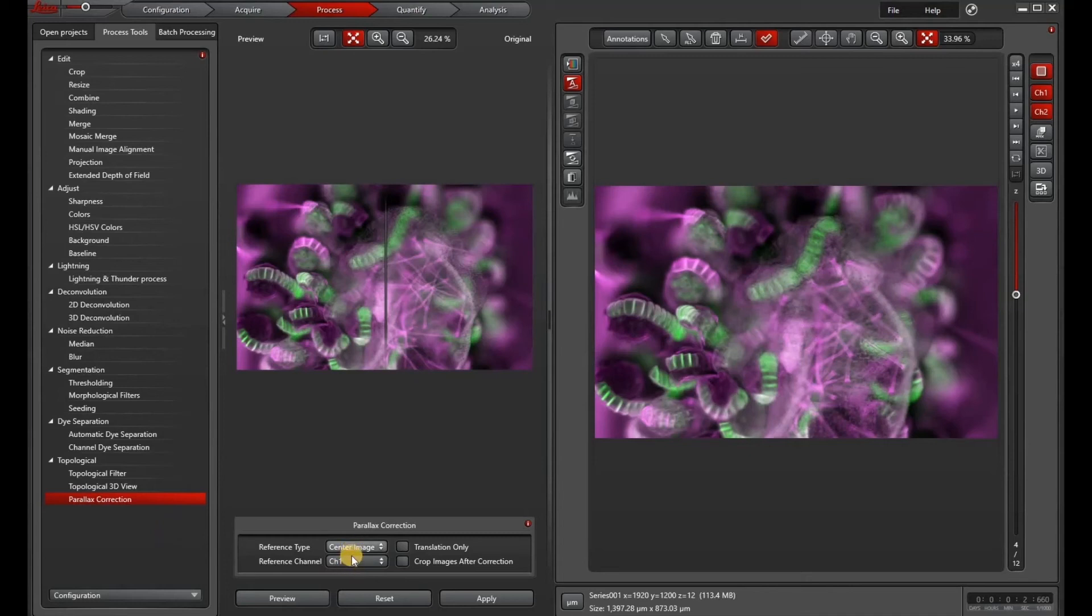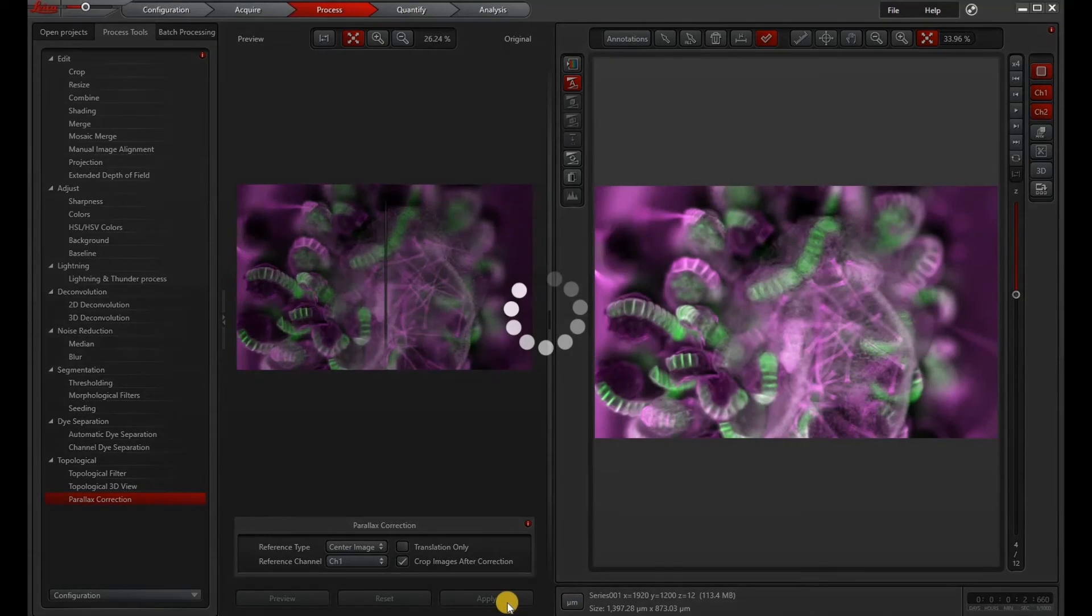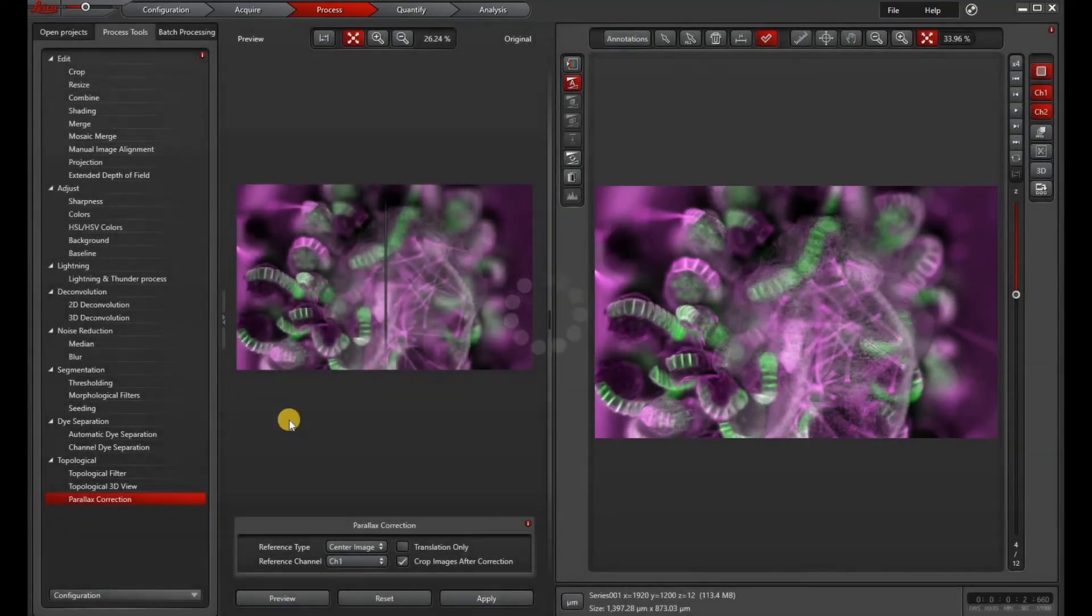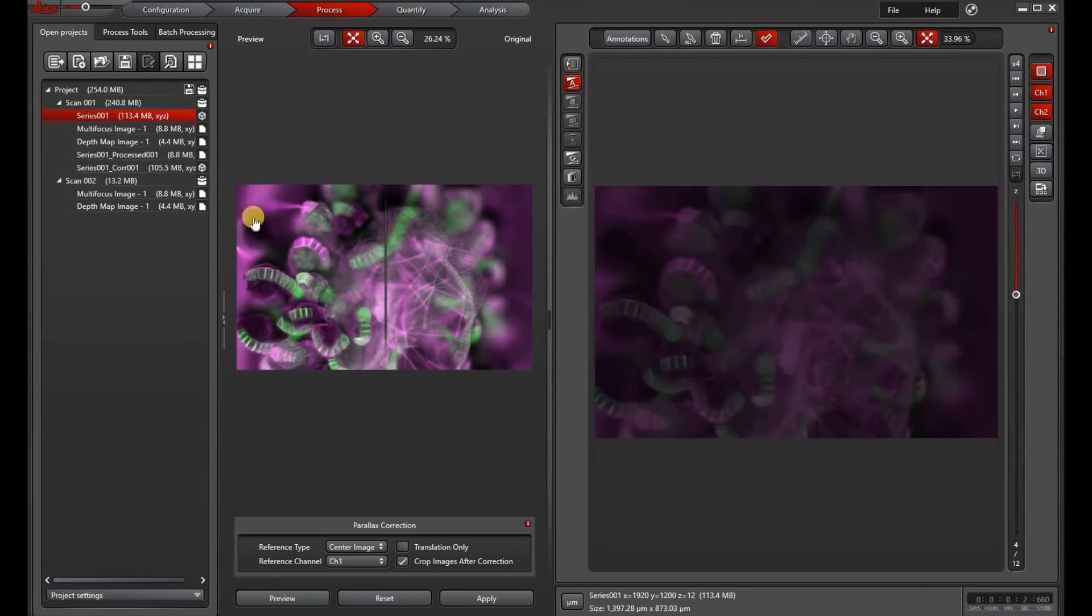So under parallax correction, I will choose a couple of options here and then hit apply.